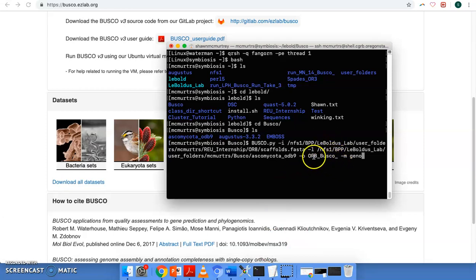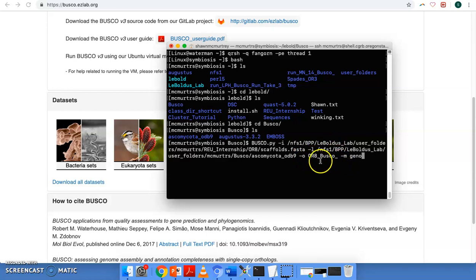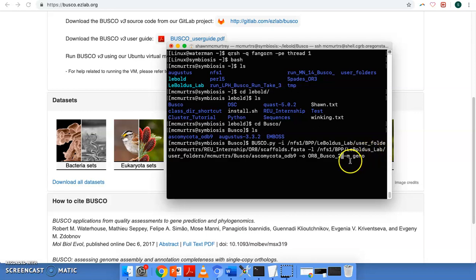Then after that, dash O is output, like usual. And then we're just going to call ours busco. We'll call it two, because I think I've ran this before.